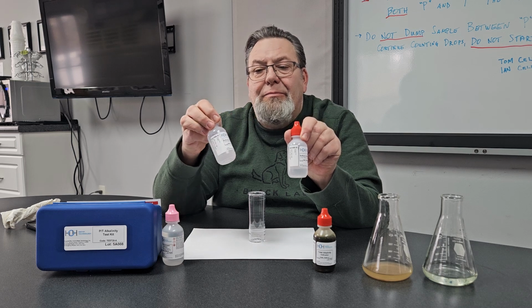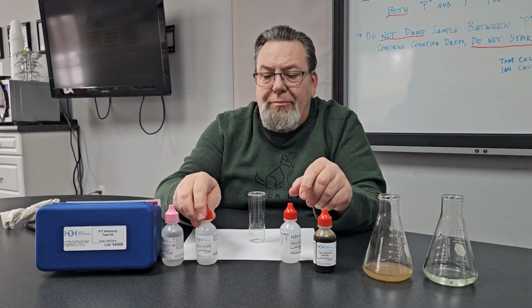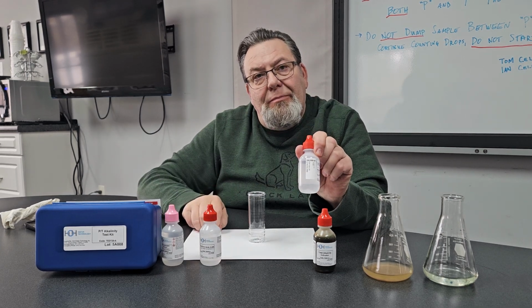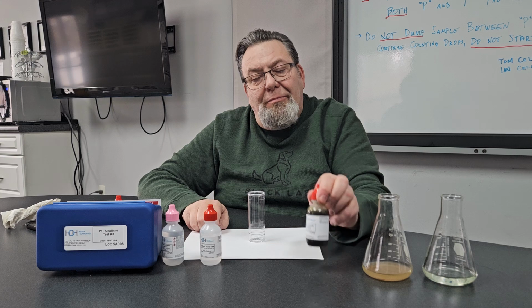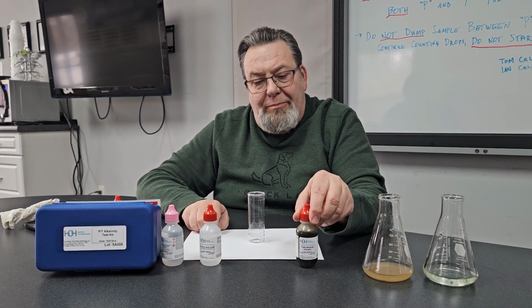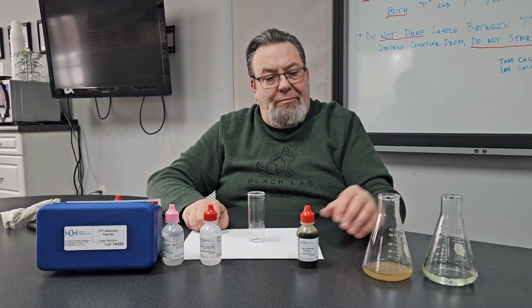For boilers, you should be using, most often, the sulfuric acid 0.6 N, or 50 parts per million per drop. The lower range is 10 parts per million per drop and will be set aside for the purpose of this demonstration. You will likely not need to use that during your daily testing. Lastly is the total alkalinity indicator solution. This will turn your sample green, and you'll titrate that green to a purple-pink color.